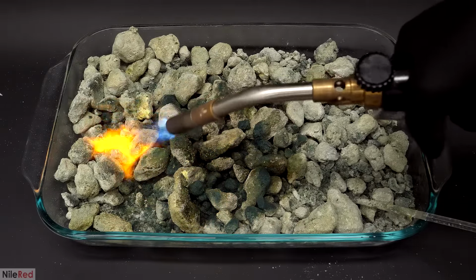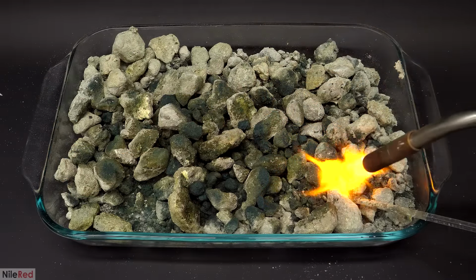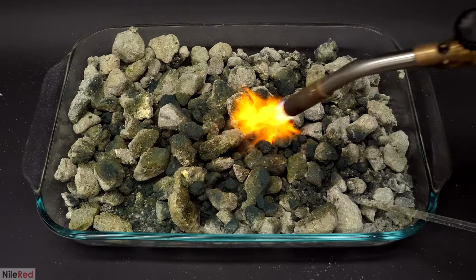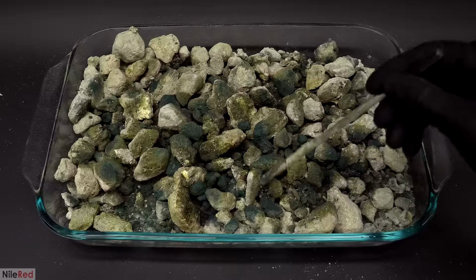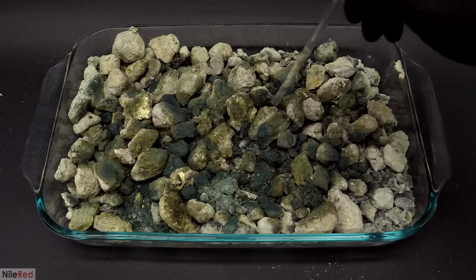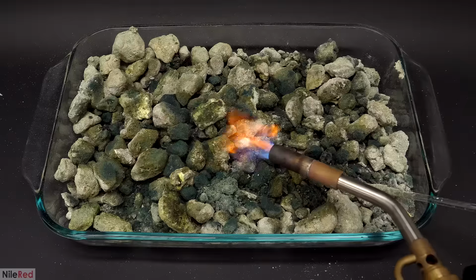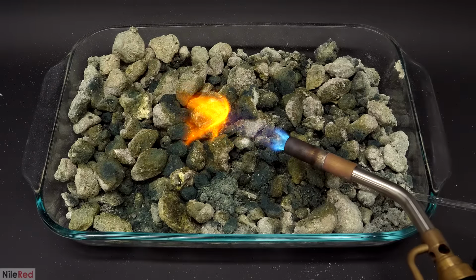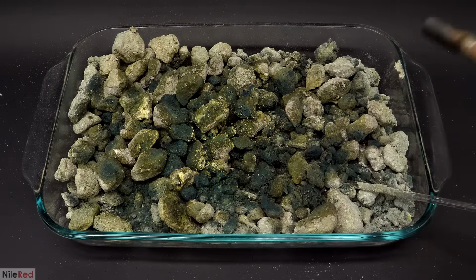I think this was because there was a huge amount of sodium sulfate here, which formed from the reaction between the sodium hydroxide and the sulfuric acid. This salt, like many others, is able to absorb water and to form a complex with it. This physically incorporates the water into it, so it's no longer able to evaporate. If I wanted to fully dry it, I had to first break down this complex by heating it, and then I had to keep heating it to drive off the water.